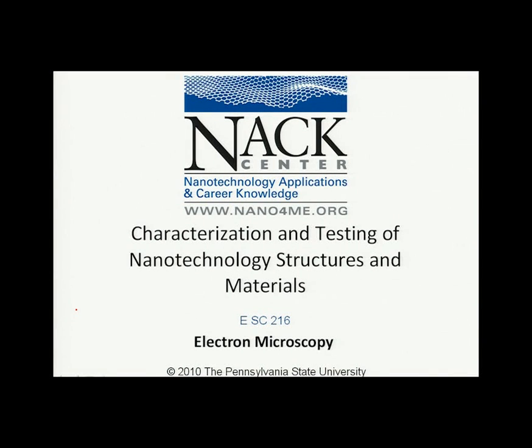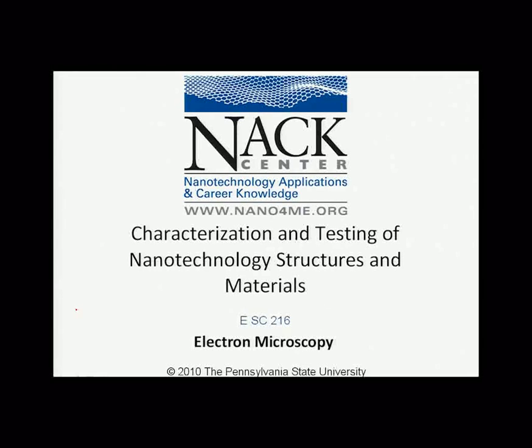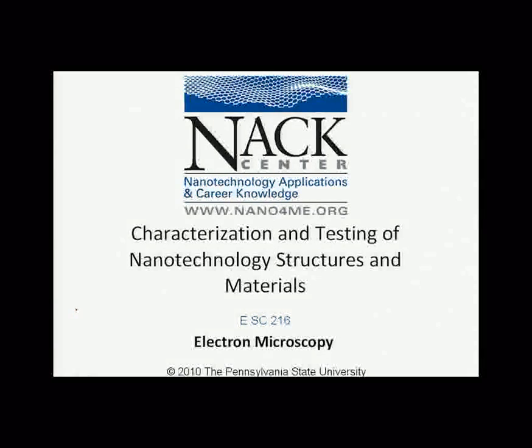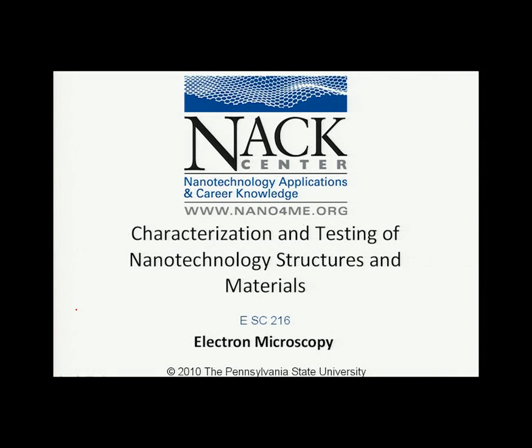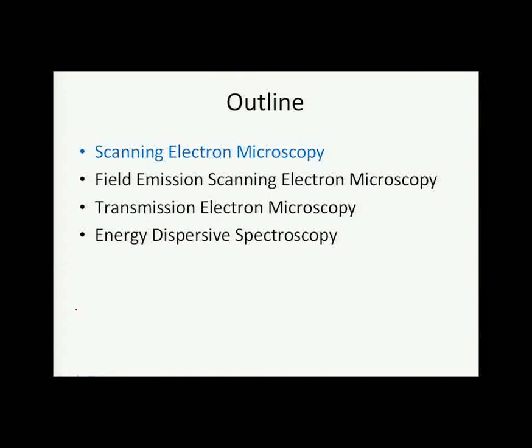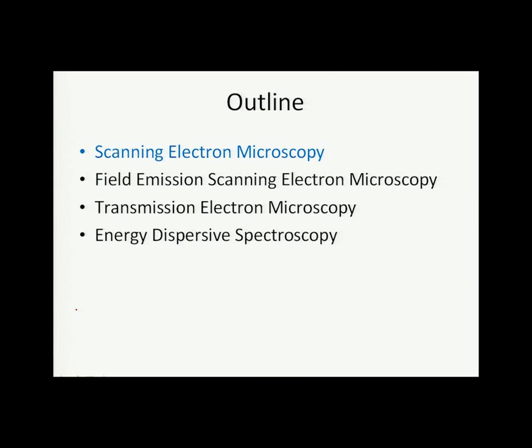Today's lecture is on characterization and testing of nanotechnology structures and materials. And specifically today we'll be discussing electron microscopy. The outline for today's discussion will include scanning electron microscopy, field emission scanning electron microscopy, transmission electron microscopy, and energy dispersive spectroscopy. Let's begin with scanning electron microscopy.